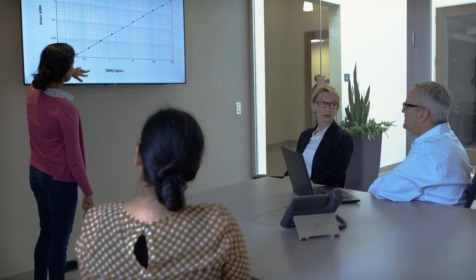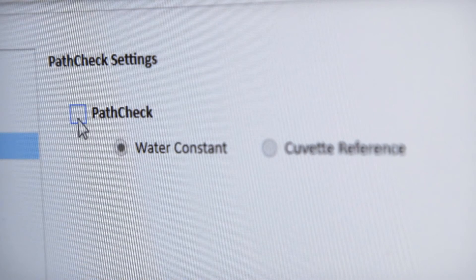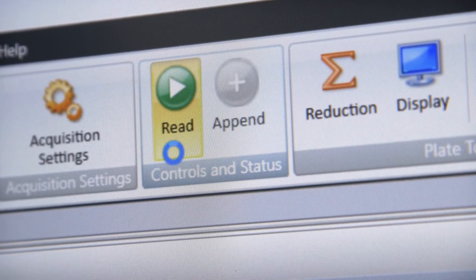We know reliability is a critical factor in research. That's why we equip the SpectraMax ABS Plus with PathCheck technology, the only temperature independent path length correction method.